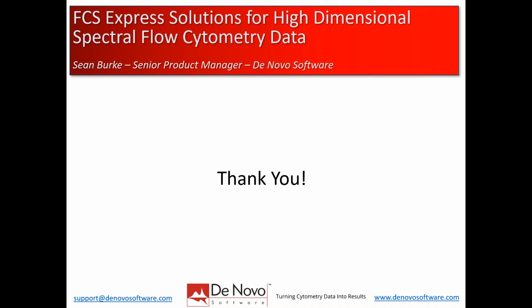Again, that's coming in the release that we're going to have in the summer. In the past, folks have used the R integration in FCS Express to run data cleanup tools. But again, a lot of the classical cleanup that you've been doing simply with gates is there. And if you found that there are some unmixing errors and you didn't want to go back to the spectral flow software for some reason, you could actually do some additional unmixing in FCS Express, which might help you figure out what's going on with some of the data.